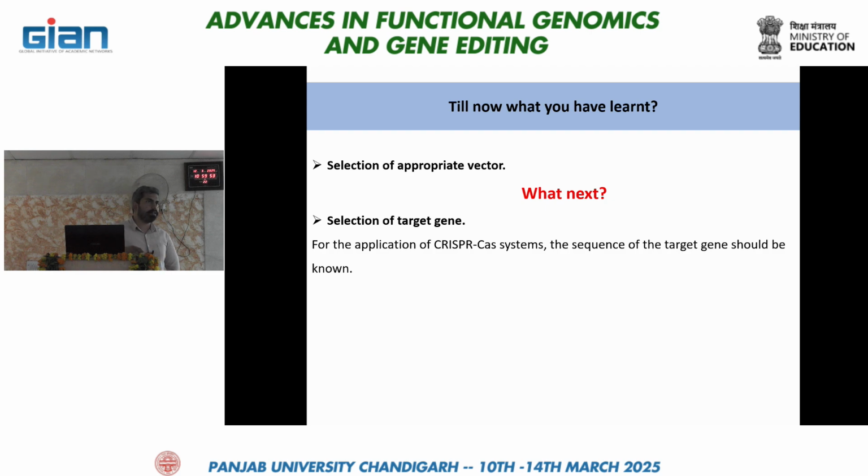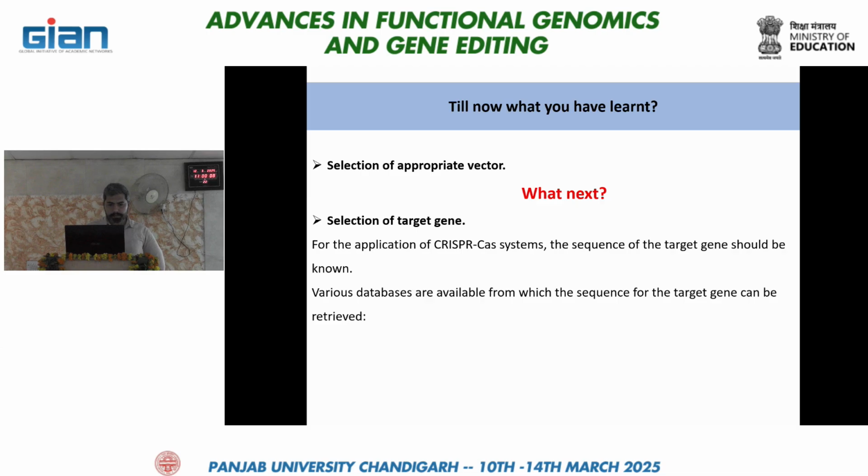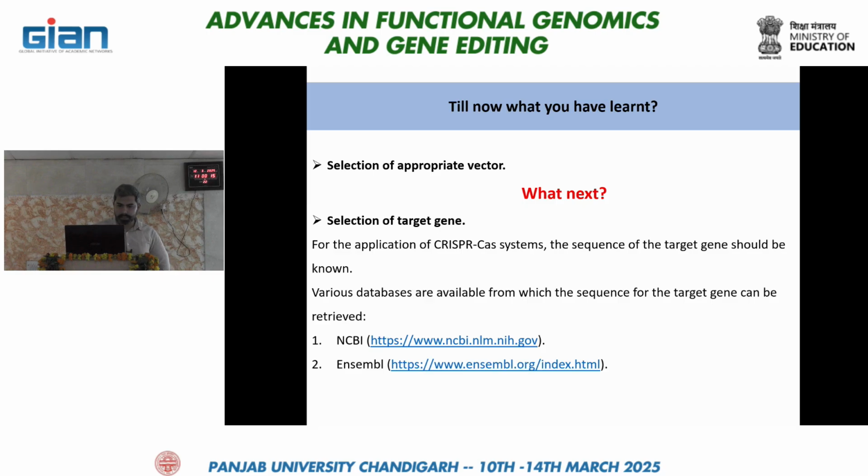Like you can blast search and find out the particular homologs associated with that genome if the genome is available. But the main thing is that the gene sequence has to be known. And to retrieve the gene sequence, there are various databases available. To name a few, the common ones are NCBI, Ensembl, Ensembl Plants. I hope all of you are aware of this. So we will try to retrieve and give you a live demo of it.